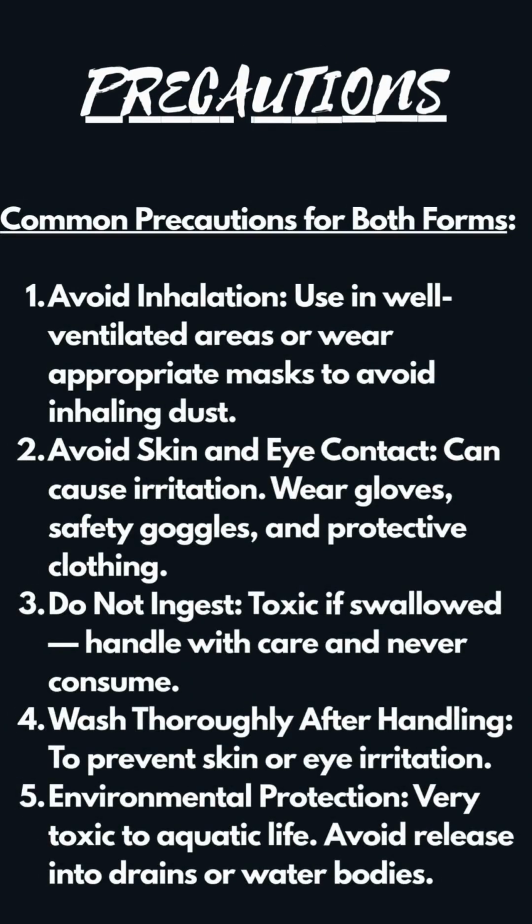Anhydrous copper sulfate is classified as harmful if swallowed and can cause serious eye irritation. It is toxic to aquatic life and must be handled with care. Avoid direct contact with skin or eyes and do not inhale any dust. Always wear safety goggles, lab gloves, and a lab coat when handling the substance. Spills should be cleaned immediately using damp paper towels and disposed of according to the lab's chemical waste protocol.